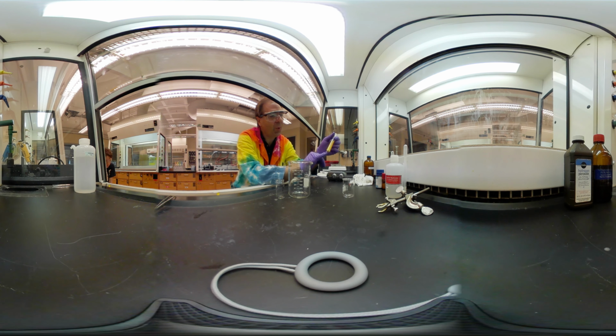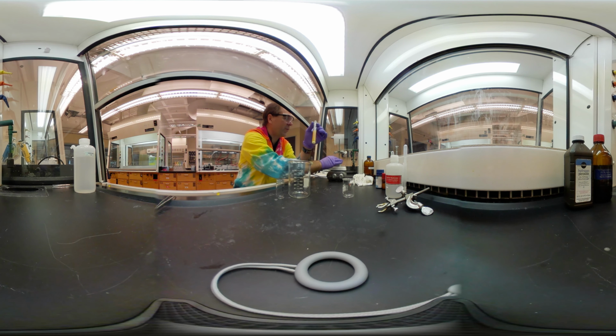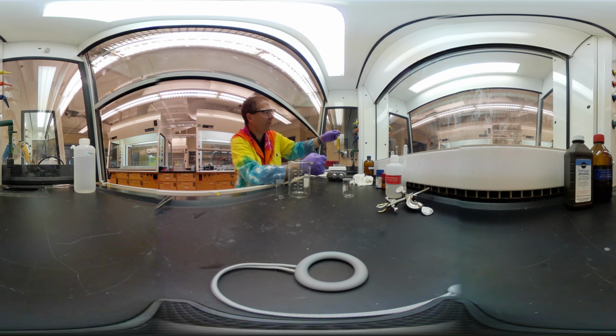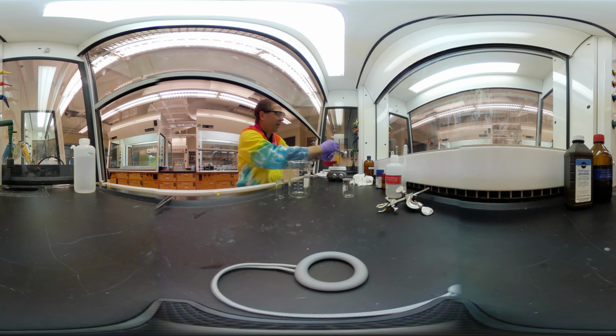But I want to get even more, and so we're going to reflux this for about 5 minutes. So I have to be careful. I can't do a very vigorous reflux because I don't have very much space in the top of the tube. The other thing is that was fairly concentrated sodium hydroxide, and this is an exothermic reaction. And I know it's exothermic because the test tube got hot, so it's giving off heat. But we're going to go ahead and bring this up to a boiling temperature.